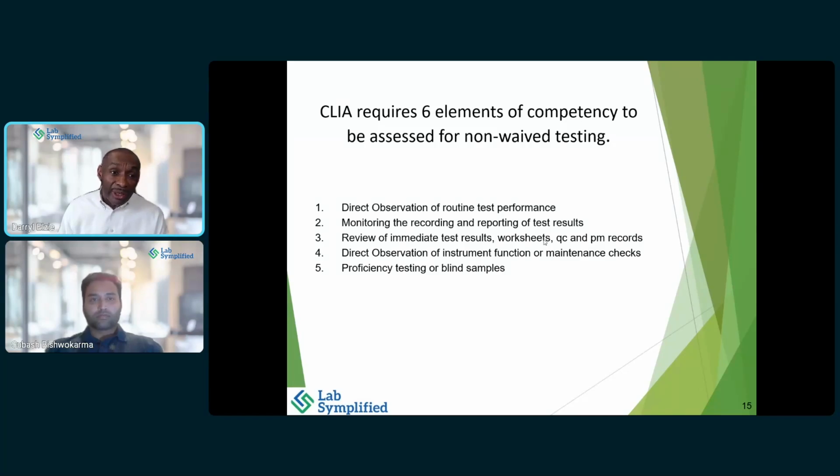Especially if you come across a rare test and it's positive, that's a great one to save and aliquot out and say, hey, I can use this to get my competency done. Think about that here now at the beginning of the year.